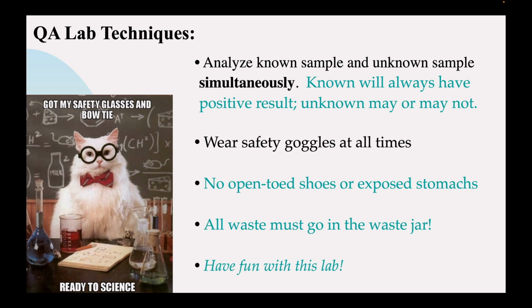I want you to be prepared for bear here. If you don't meet the bear, that's good too. I don't really want you to, but I just want you to be prepared. All the waste you create has to go in the waste jar. None of this is fish friendly, but more importantly, I know this sounds weird, have fun with this lab. People usually enjoy this if you can watch the colors happen, so try to sit back a little bit, relax and enjoy the show.